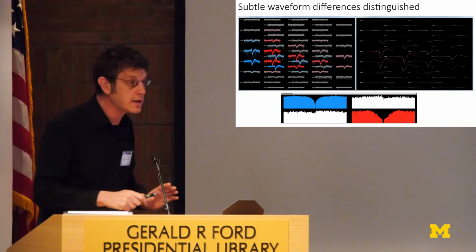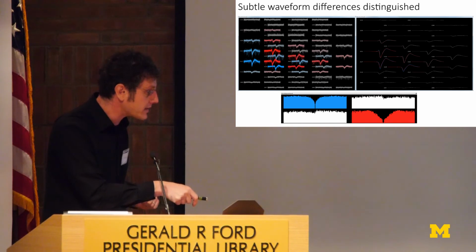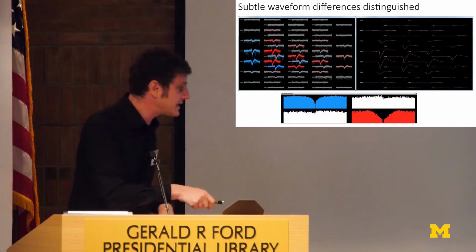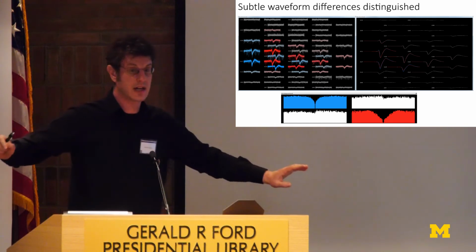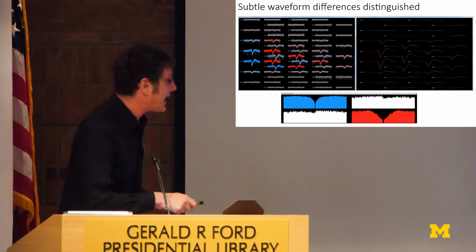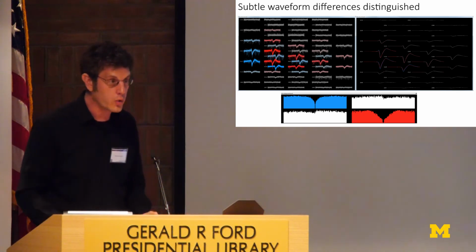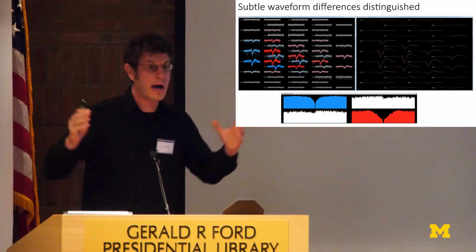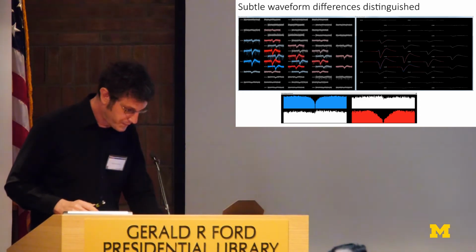But we know they really are different cells because down here, you see the autocorrelograms of each cell showing a refractory period, as you would expect for neurons. But in the cross-correlograms, there's nothing. There's no common refractory period. This means it wasn't one cell that was artificially split in two. It was two cells with nearly an identical waveform. Had we not had this dense set of channels, we would not have known that this was two separate neurons, which is an example of how having these new advanced electrodes lets you do better science. We just wouldn't have been able to tell that before.